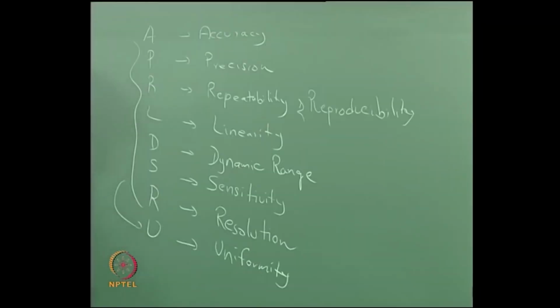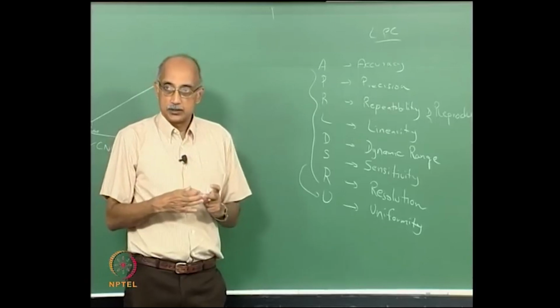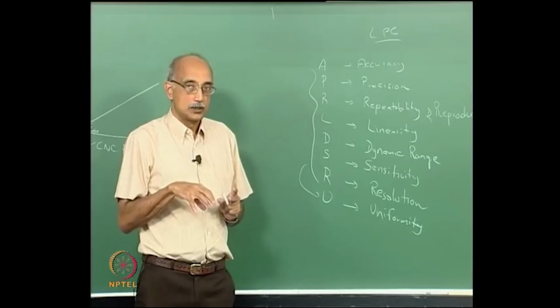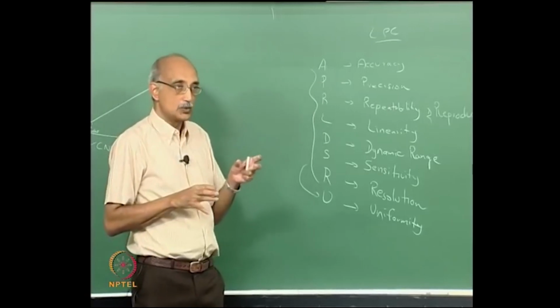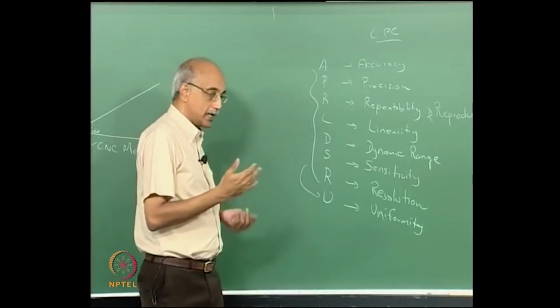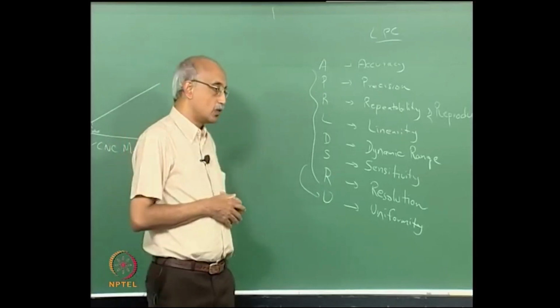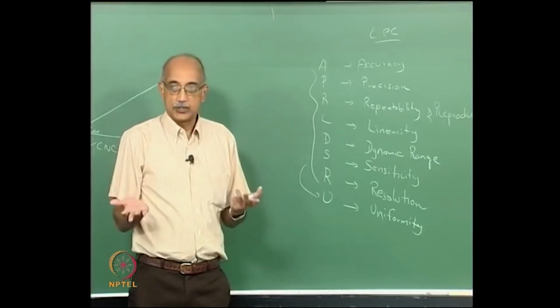So, for example, in the case of particle counting, the gold standard still remains collecting the particles on a filter and using microscopic inspection to do counting and sizing. The microscope and even the filter that you use to collect the particles will be different depending on the size range you are interested in. For example, if your sample only has particles that are 100 microns and larger, then you can use a fairly coarse membrane filter and an optical microscope as your absolute standard.